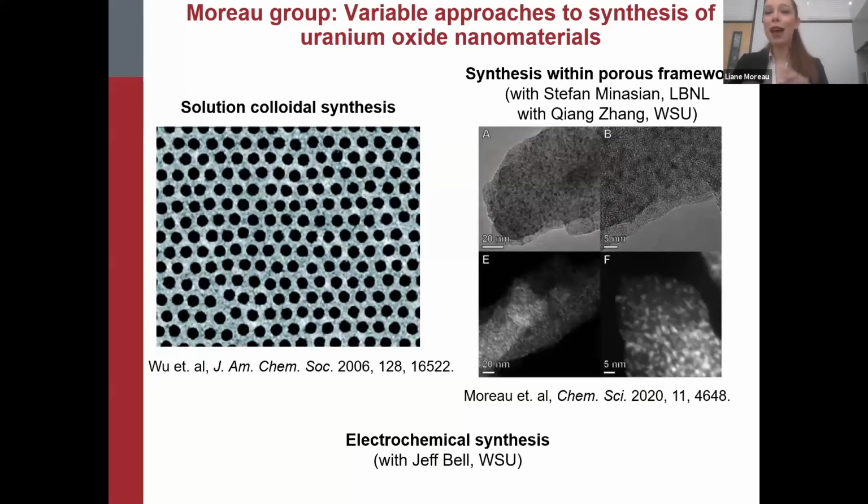And then also, neither of those systems, I should mention, because of these higher oxide complications, pretty much everything that we do is in a very controlled, inert atmosphere. Once the particles are exposed to air and water, uranium has a tendency to want to be uranium-6 instead of uranium-4, and as a result we might expect higher oxides to form. So we have also developed ways to start to look at aqueous systems. We're running some electrochemical synthesis and electrochemical reduction of uranium to form particles that should be better to look at more environmentally relevant systems.